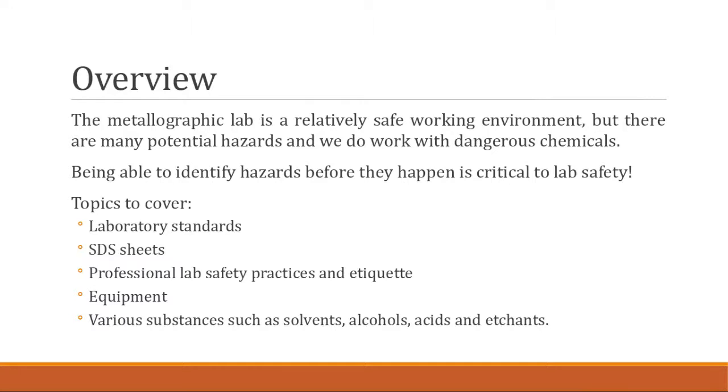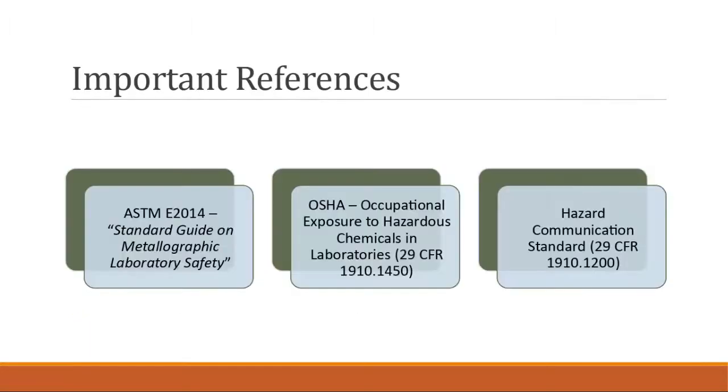So just some topics to cover: laboratory standards, some SDS sheets, the importance of being professional and practicing etiquette in the lab, looking at some of the equipment and various substances that you'll be dealing with in the laboratories. Some quick references that I've posted onto Blackboard are the following.